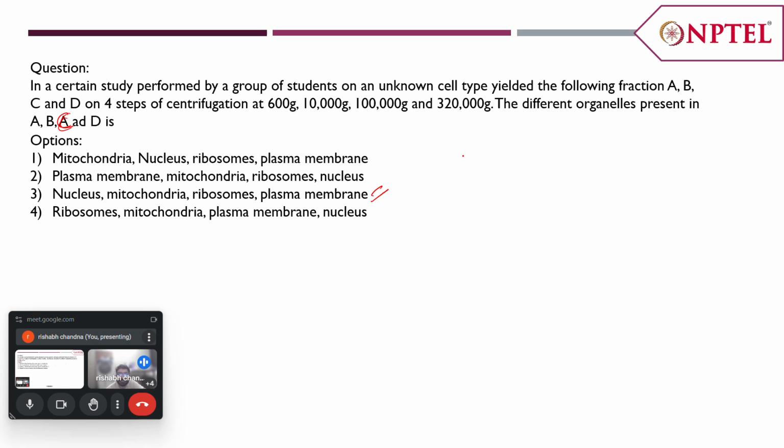This is the case of differential centrifugation. In centrifugation, like electrophoresis, it also separates the molecules on the basis of their molecular mass.